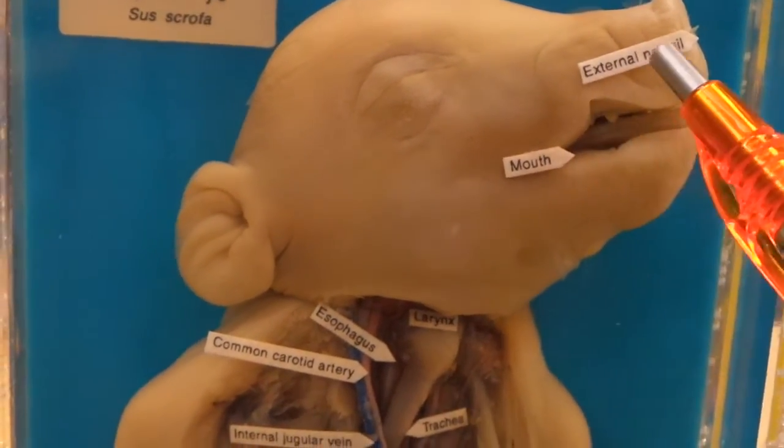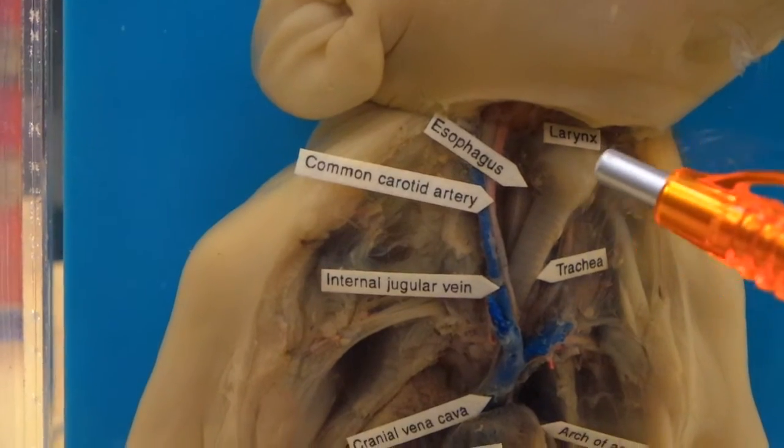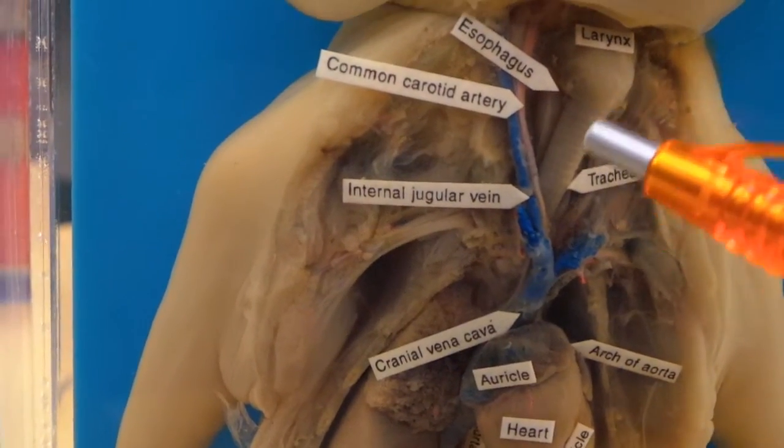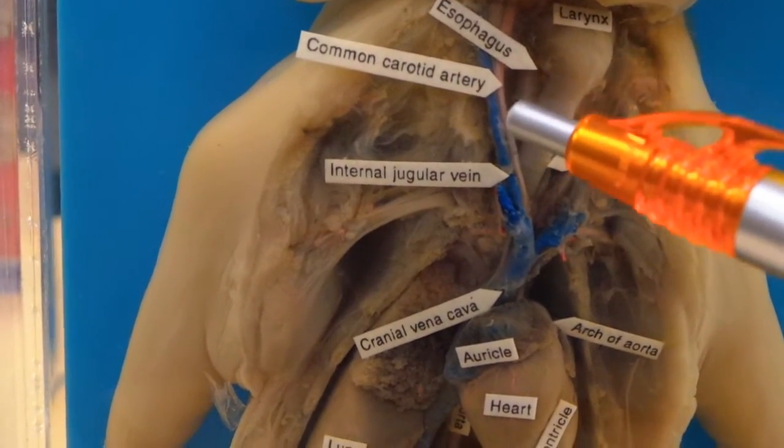Starting from the top over here: external nostril, mouth. This right here will be your larynx. It's pointing over here because remember the trachea, which is right here — the esophagus is behind it. So that's the esophagus.